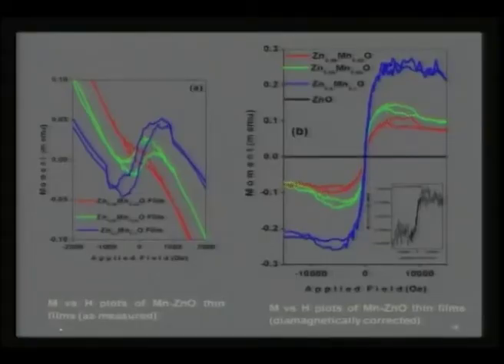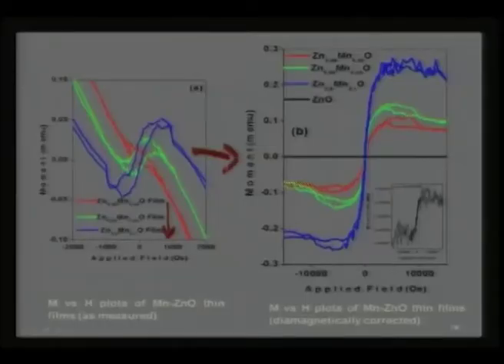Now, what is more convincing when you look at it is the magnetic property, unlike the other case where you see a faint magnetic signature. If you look at the PED grown films, then for 2 to 10% you can clearly see the signal changing. For 2% you see a negative slope. This is coming mainly because you are using a quartz plate, and therefore the diamagnetic contribution is more. So, you can actually do a diamagnetically corrected compound, and in that case a clear loop is found. This is at room temperature.